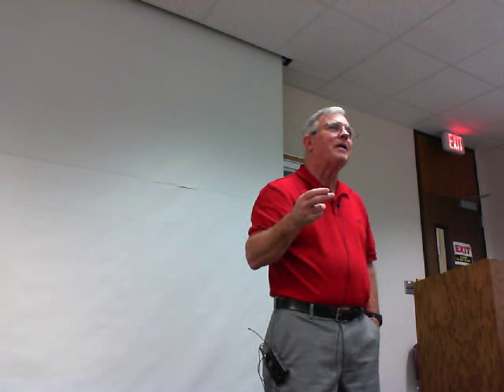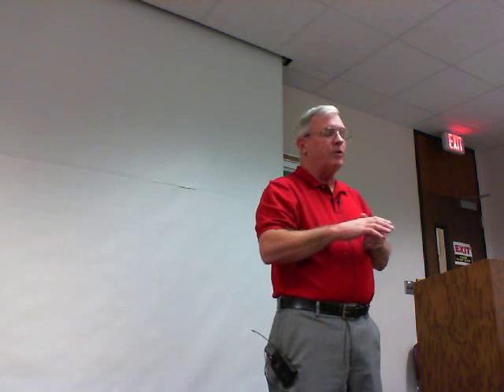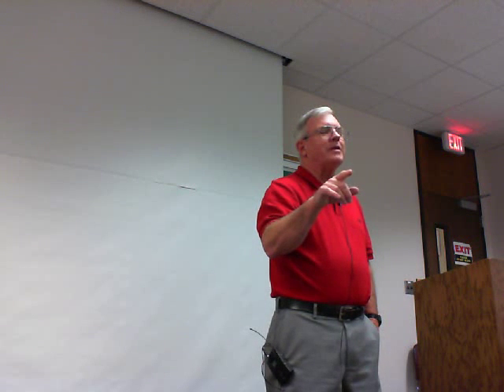I'm assuming with the slides where we can move it will be marked. Yeah. So when you come up, on the little post-it note we'll have the number. We'll say identify cell, identify tissue, identify structure, what does this cell secrete, or something along those lines. And then it'll say do not move. That doesn't mean you.